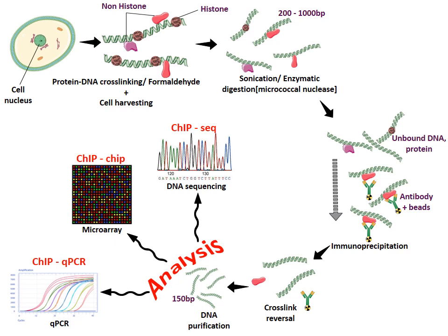And for efficient immunoprecipitation, the protein DNA cross linkages are processed for the fragmentation into smaller workable fragments, usually of 200 to 1000 base pair, and it is done either mechanically by sonication or enzymatically by the use of micrococcal nucleases.